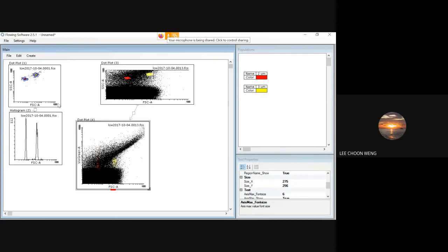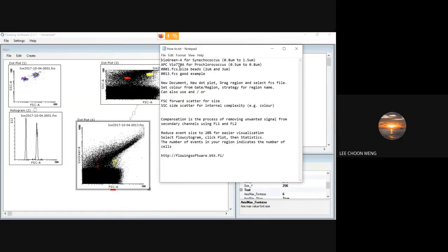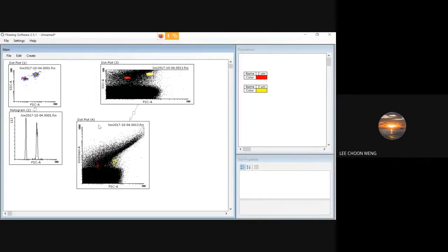Okay, so for Prochlorococcus, it's APC Vio 770A. Okay, so let's make another one.